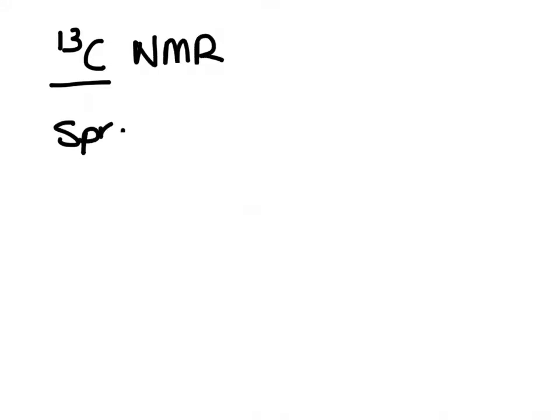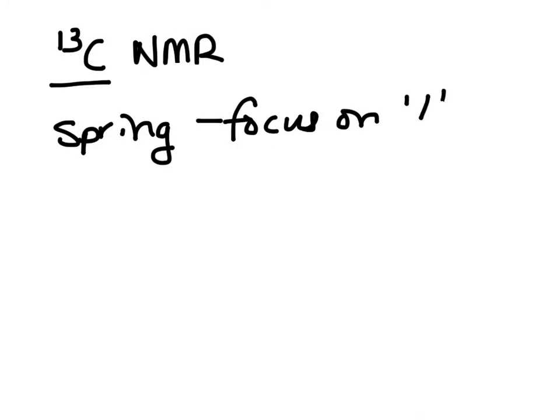So we've already had some encounters with NMR spectroscopy. In the fall semester we looked at carbon-13 NMR. In the spring semester we will still look at carbon, but we're going to focus on proton. Alright, so now we're going to go through some theory, some basics in the theory, and then we will look at actual spectra.